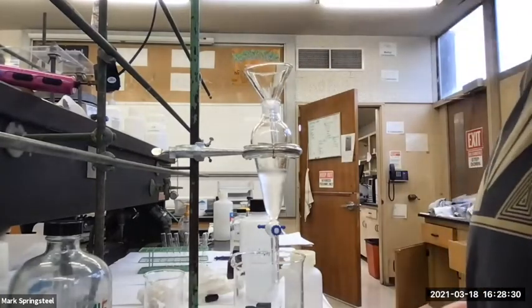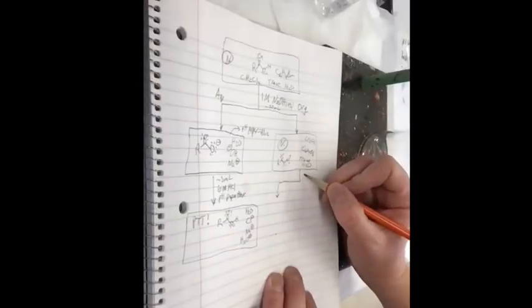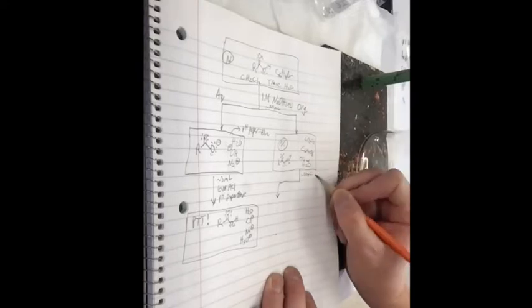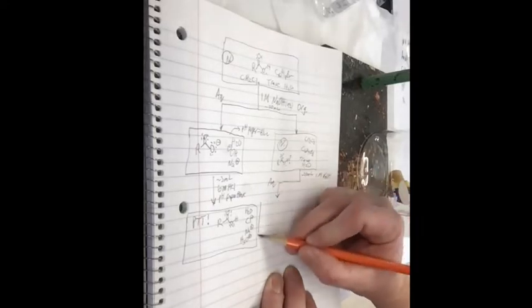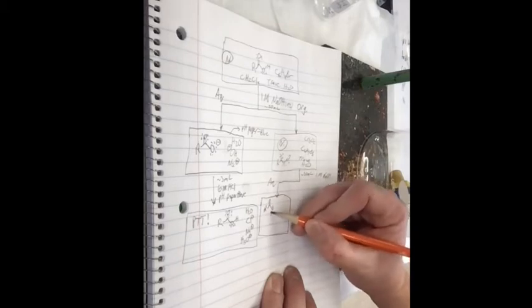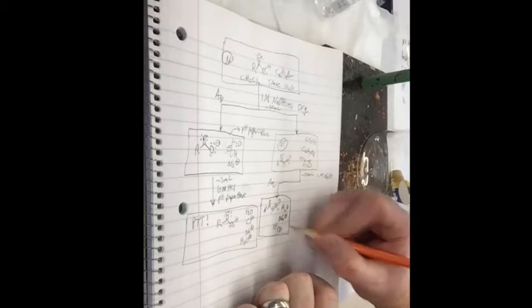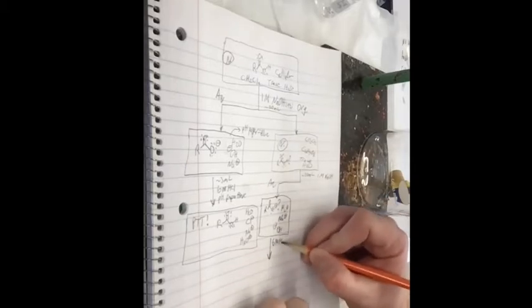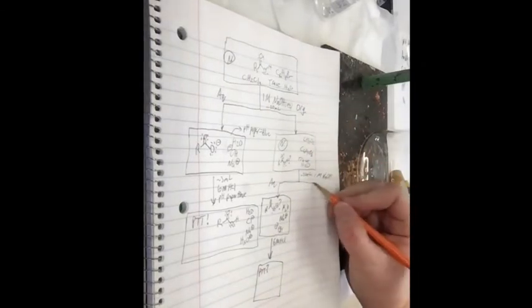All right, so here we go. We're going to add 1 molar NaOH again, right? Let's do about 20 milliliters. And our aqueous layer then should have perhaps the carboxylate. We'll see. Water, sodium hydroxide. And then we're going to treat that with 6 molar HCl till it's acidic and look for precipitate. Okay, let's try it out. And then we'll have our organic layer over here. I'll fill that in shortly.